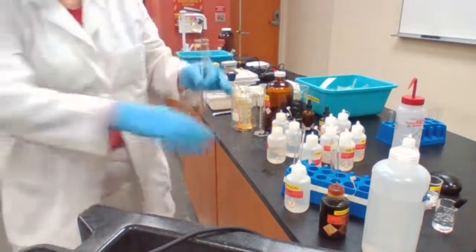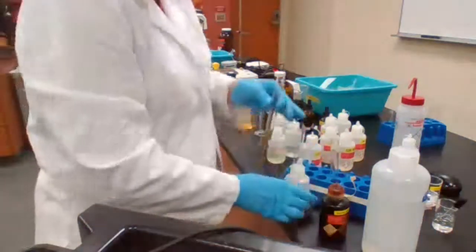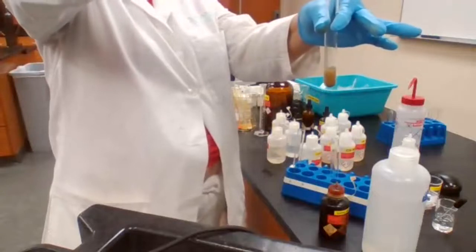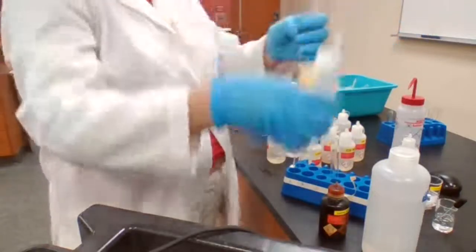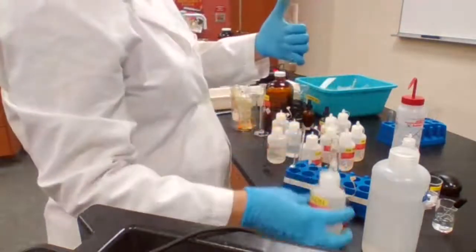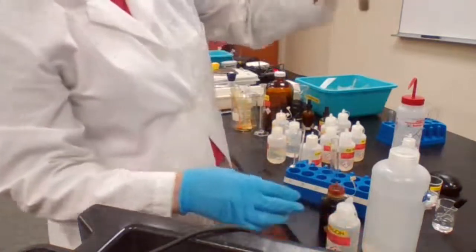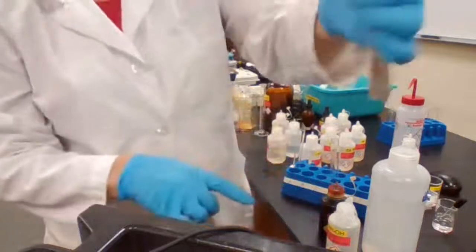I'm going to finish this part first before I show you the ester. So I have to add enough and shake until it dissolves. It has to turn clear again.